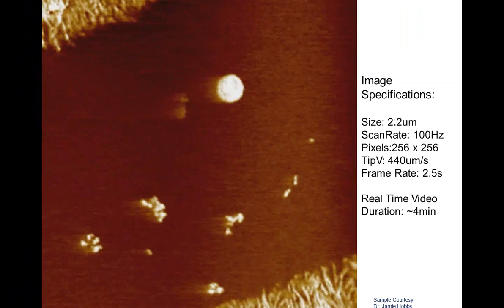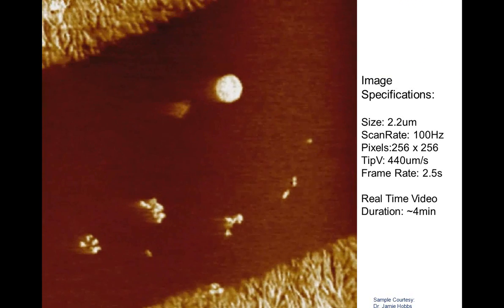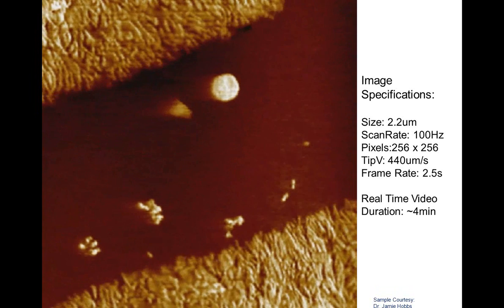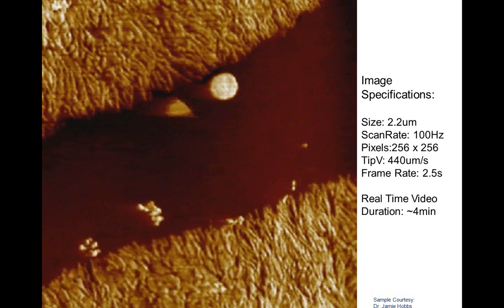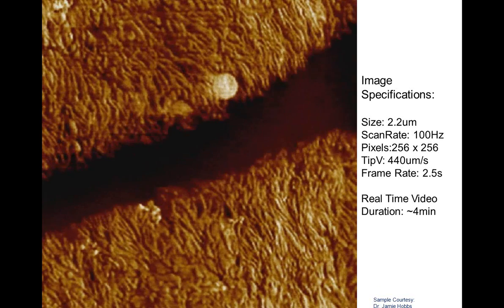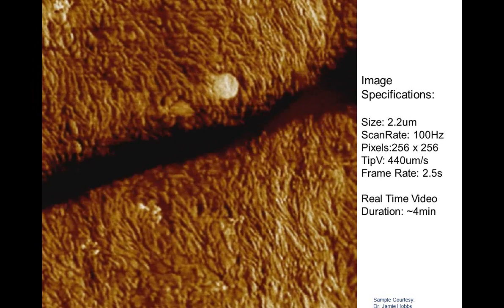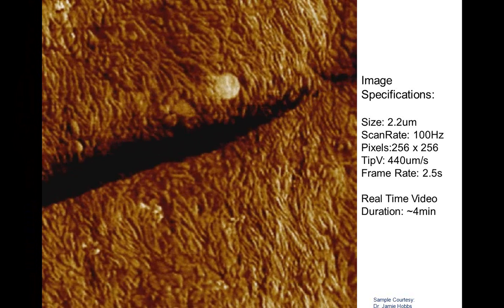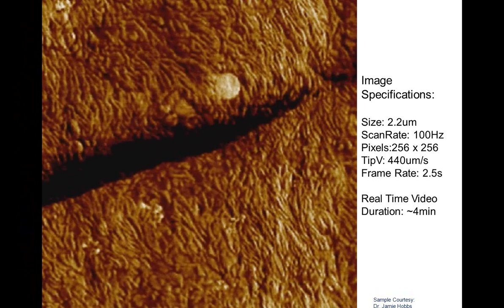So, in this example of high-speed AFM, we see 2 fronts coming towards each other, passing over defects, sometimes incorporating them and sometimes not. We can also see how, when the lamella pass larger defects, some terminate while others go around. Ultimately, the 2 fronts join, and in some regions, the lamella join. In others, an interface is created.